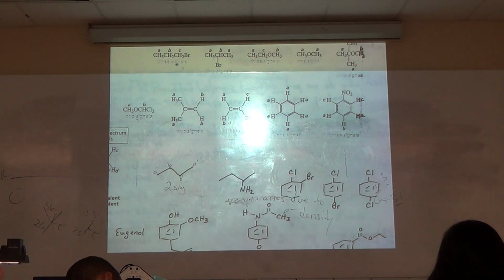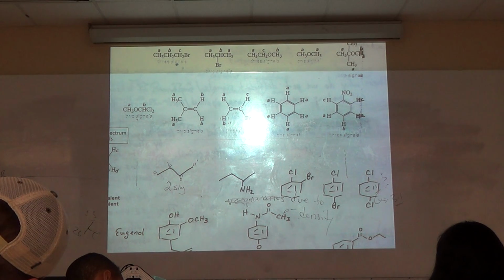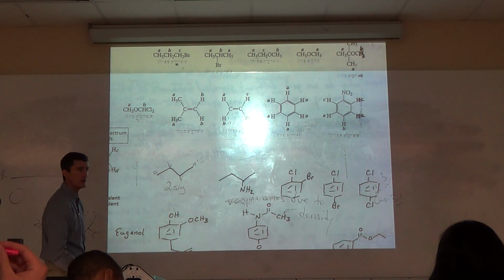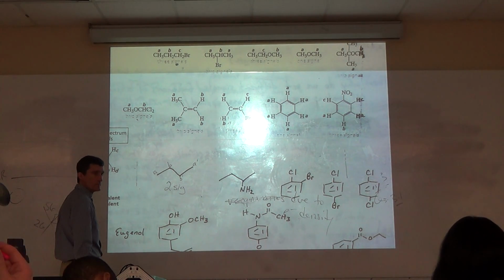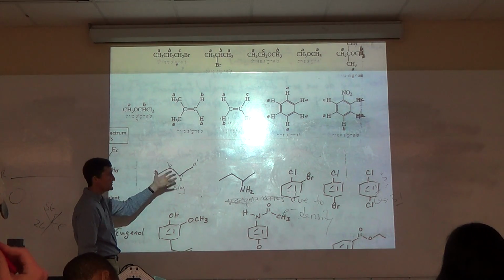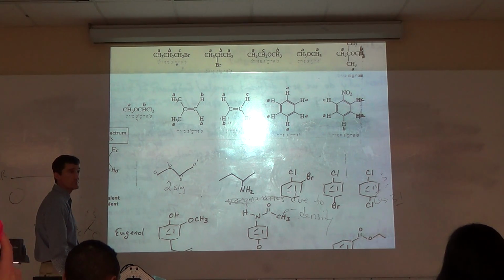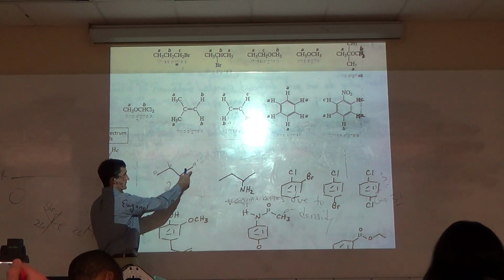So there doesn't have to be an electronegative atom involved. Why do you ask if it has to be an electronegative atom? Because before we were talking about ones with O's and stuff. Well, that's referring to shielding, de-shielding. We're not saying where the signals will be. There's nothing de-shielding here, really. We'll talk about peak position in a little bit. Right now, the number of signals is 2.